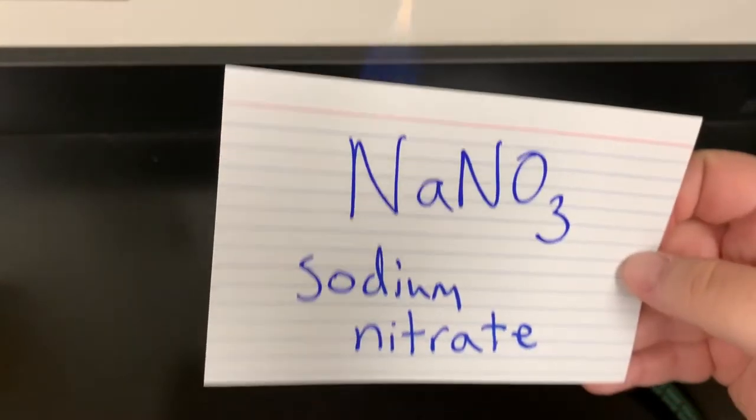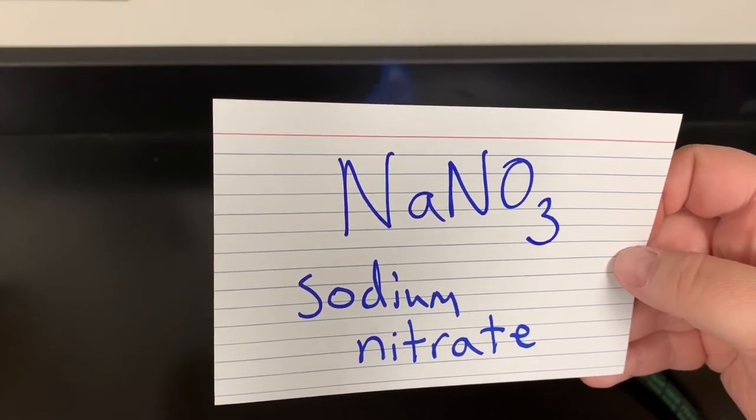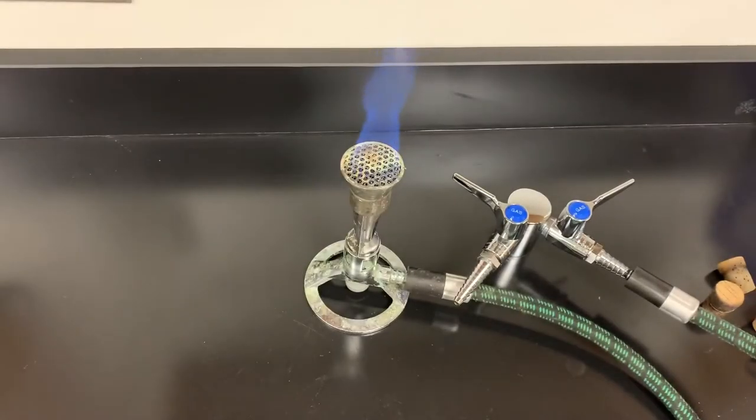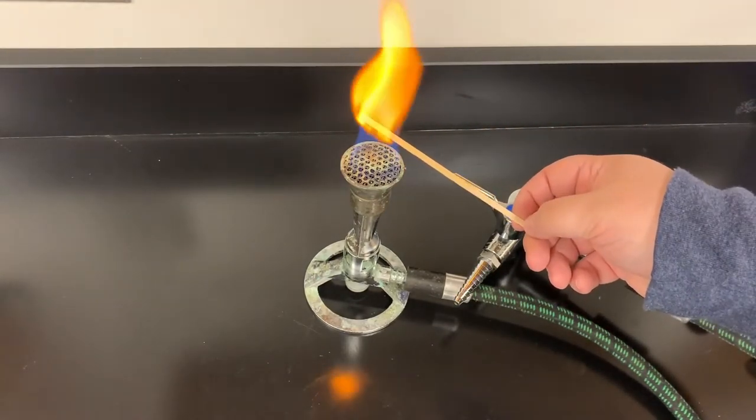Next is sodium nitrate, NaNO₃. Sodium goes bright orange.